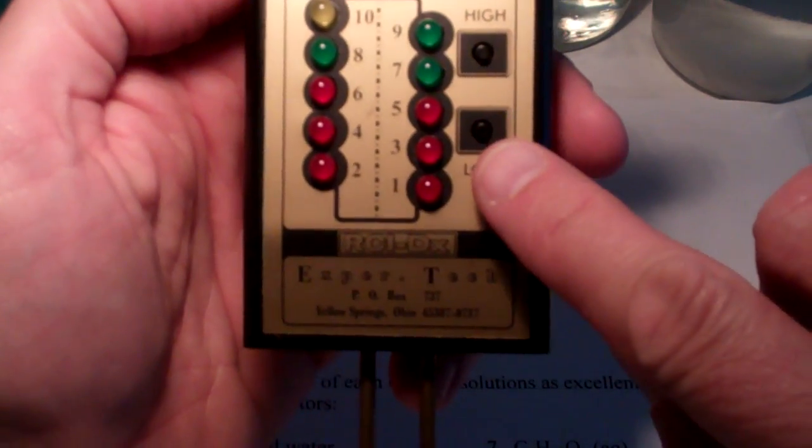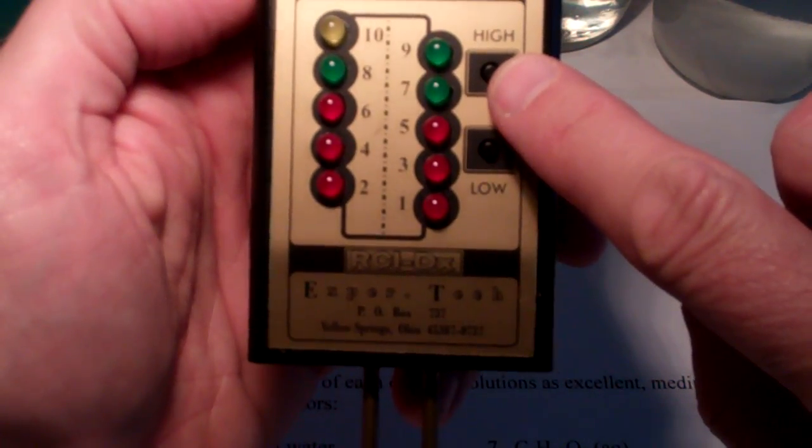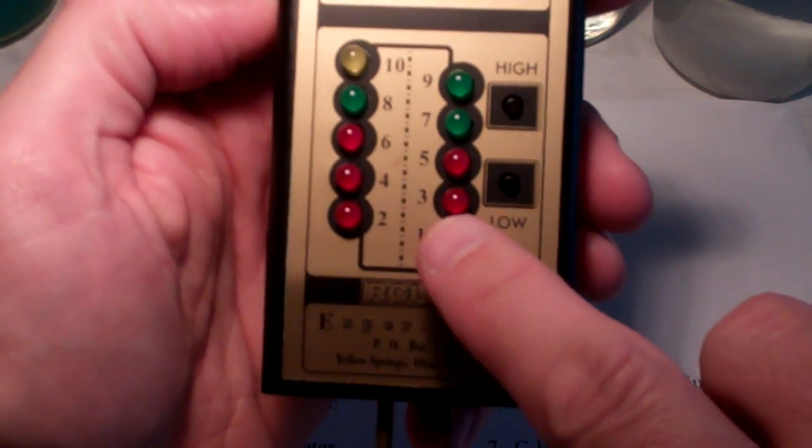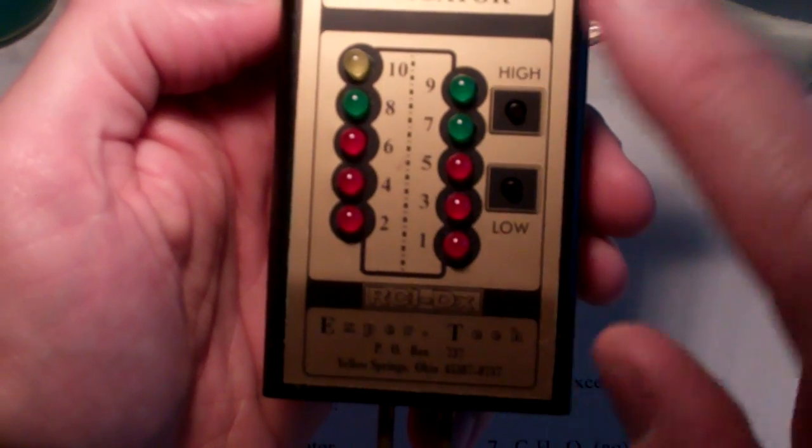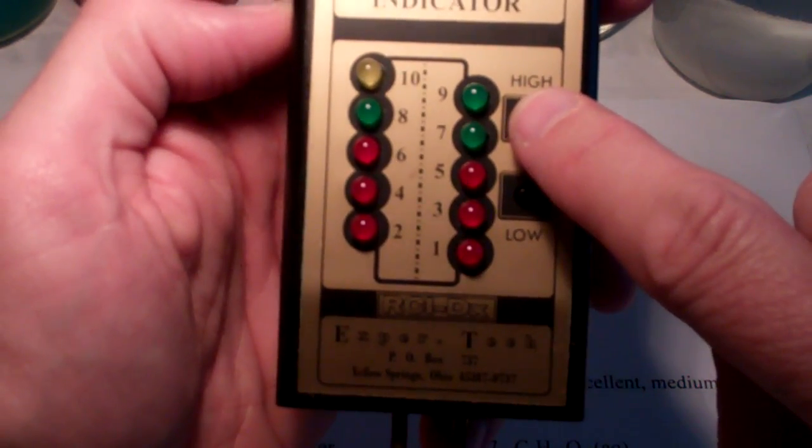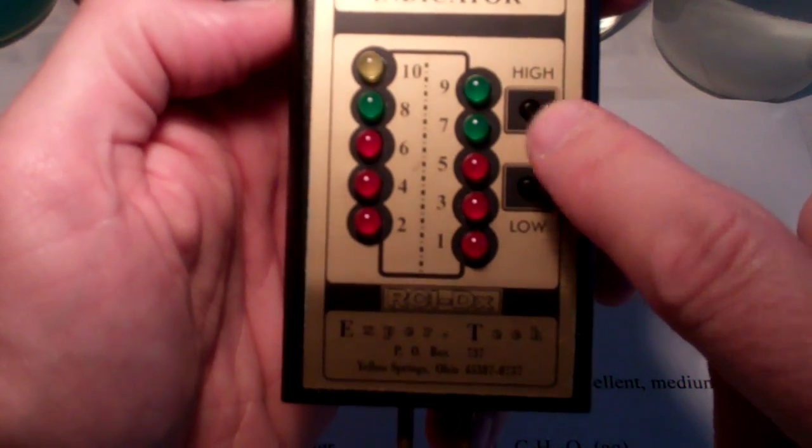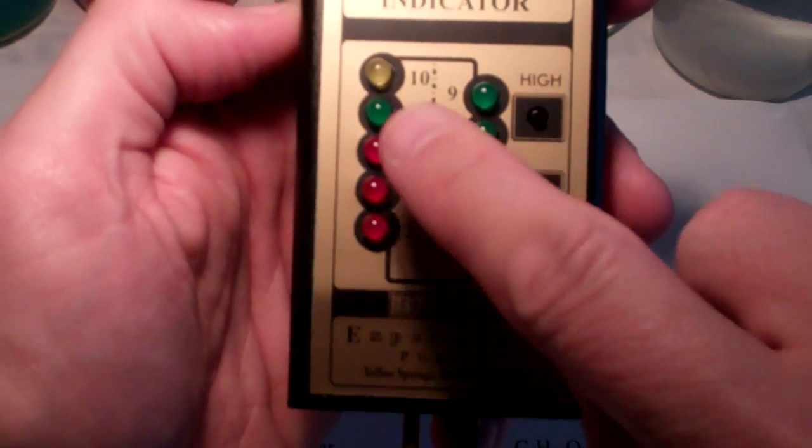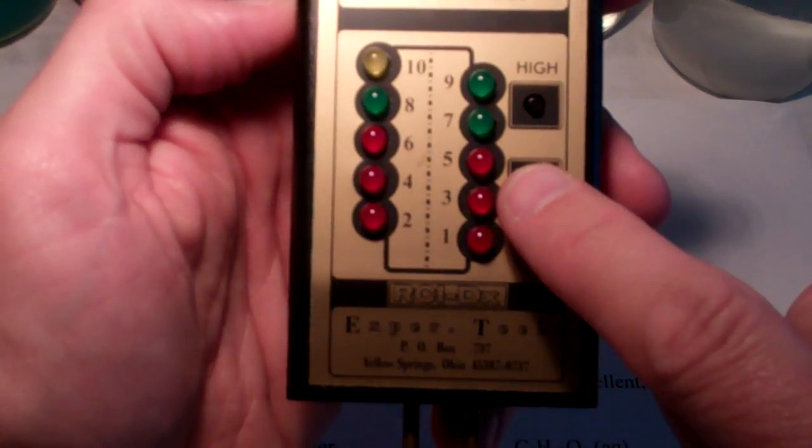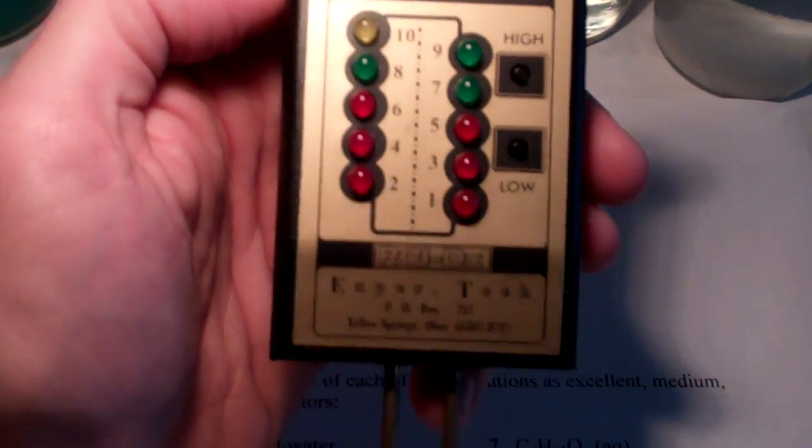So the meter has a low indicator and a high indicator. When we press low, we'll count up from 1 to 10. When we press high, we'll multiply these values by 10. So if I press the high button and the 8 lights up, then that would be a conductivity of 80. If I press the low button and the 8 lights up, that would be a conductivity of 8.